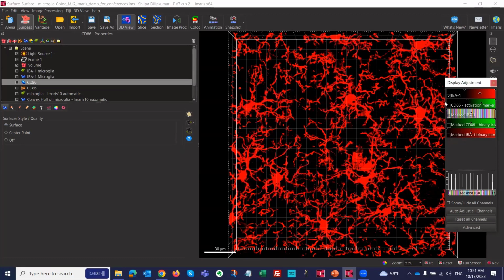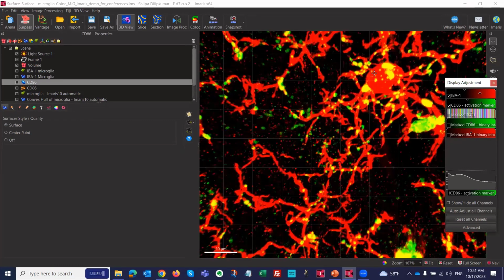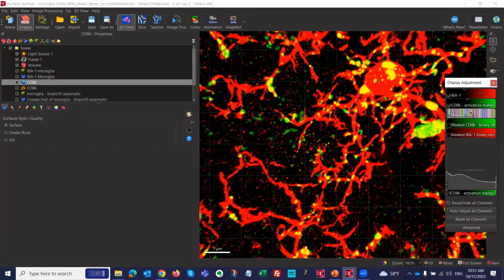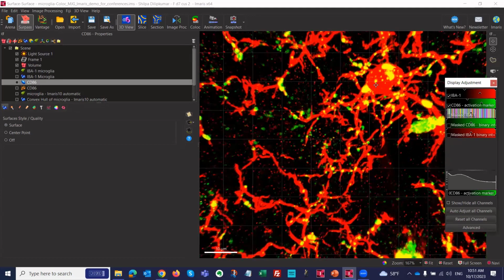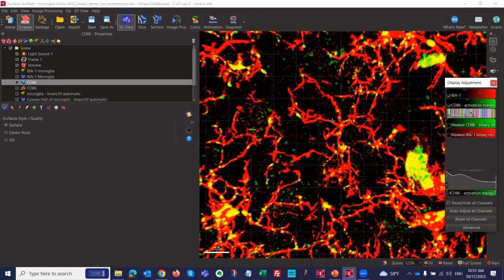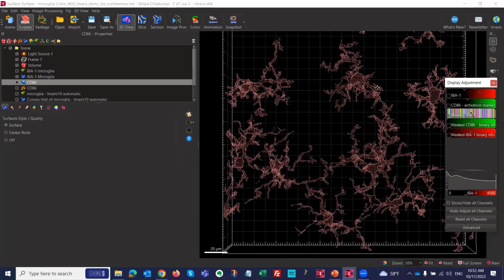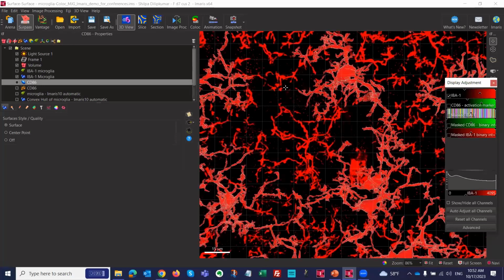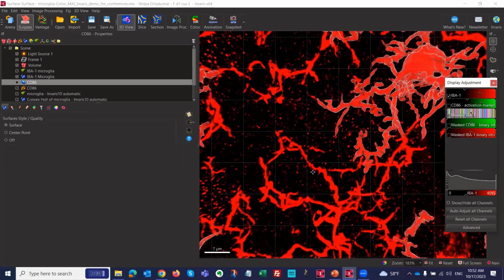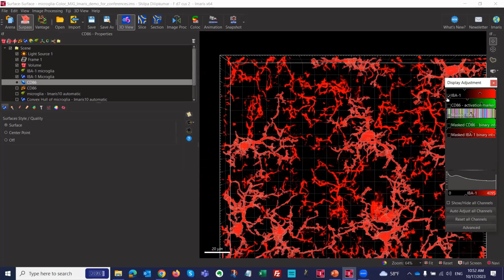This one. Okay, so this is the data set. We have microglia and some protein. Sometimes it's expressed in the processes, sometimes it's in the cell body, and there's a ton of them that are in a different plane as well. So the first thing in the workflow is to segment only the cells that are fully there, with cell body and everything, getting rid of this one because it's not fully there. So we can do this.